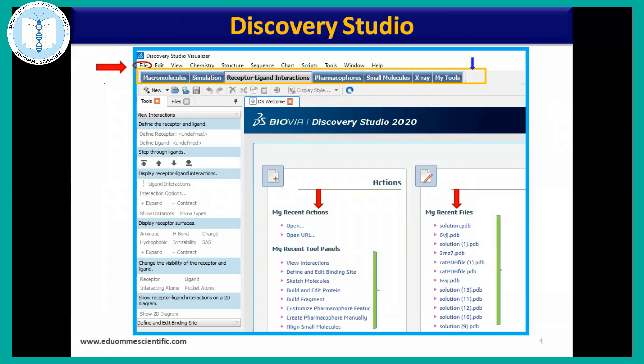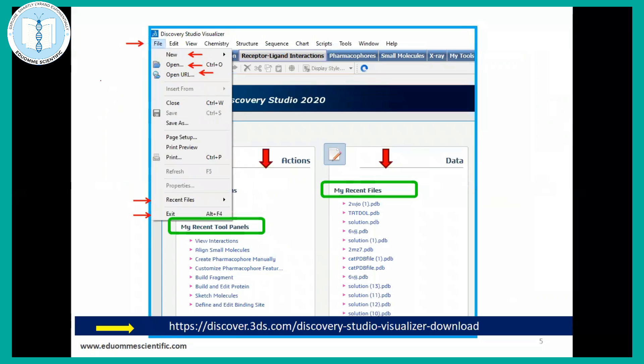Once it is downloaded, it will look something like this. From file, you may open your PDBs and other file formats. Your structures can be opened from file. All the tool panels can be visualized here. The history can also be seen here, which will make your things easier while performing the visualization and other analysis.